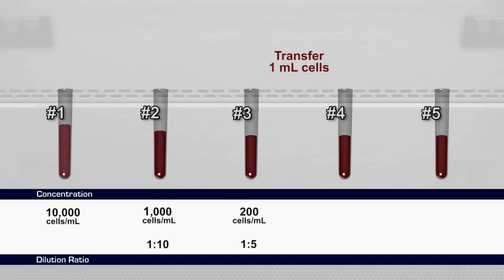Transfer 1 milliliter from tube number 3 to tube number 4 for a 1 to 5 dilution and a concentration of 40 cells per milliliter. Finally, transfer 1 milliliter from tube number 4 to tube number 5 for a 1 to 5 dilution yielding 8 cells per milliliter.